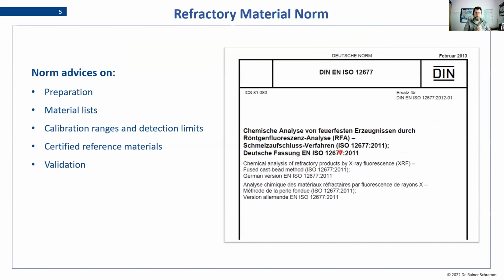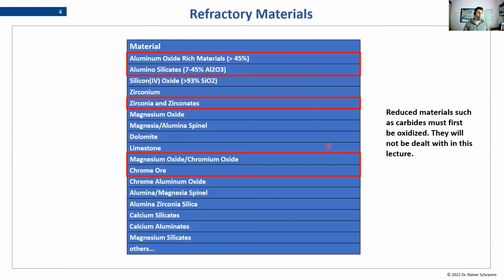A quick word about the norm, because all of these three methods we are using are norm conform, or normativ, how we call it in Germany. There is a German norm.